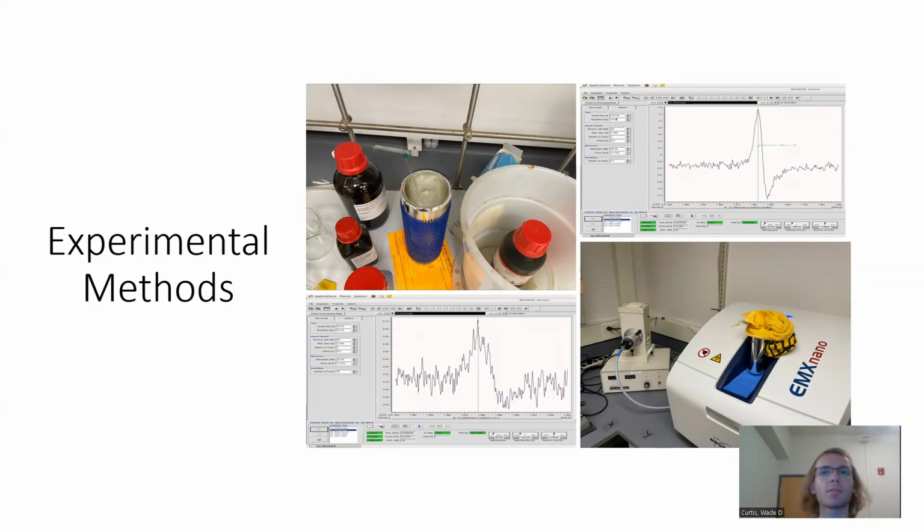A field sweep scan was taken to determine the field strength that would give the best intensity, which is the maximum of this field sweep scan. And then a temporal kinetic scan was done to monitor how the triplet state decays over time. These two sweeps gave us two spectra, the field sweep spectra, which, as I've shown, and the time sweep spectra, which is shown on the next slide.